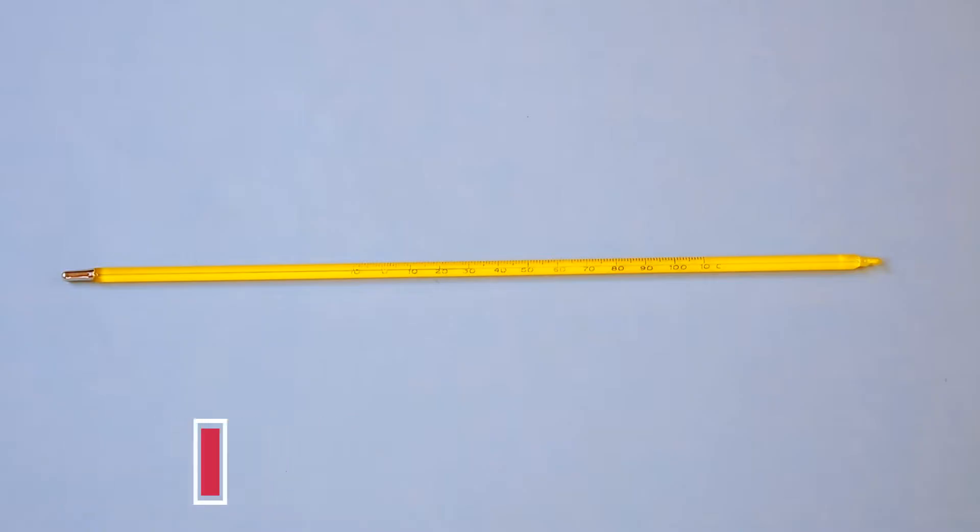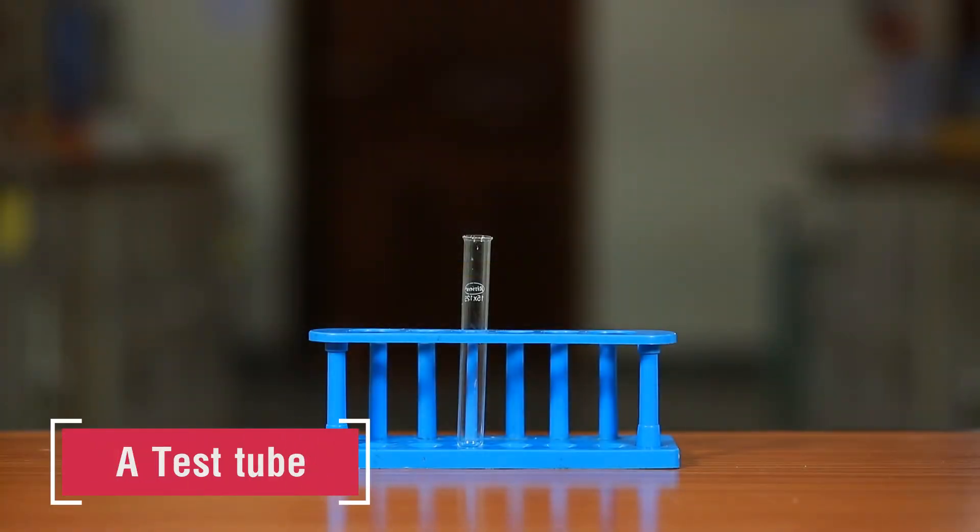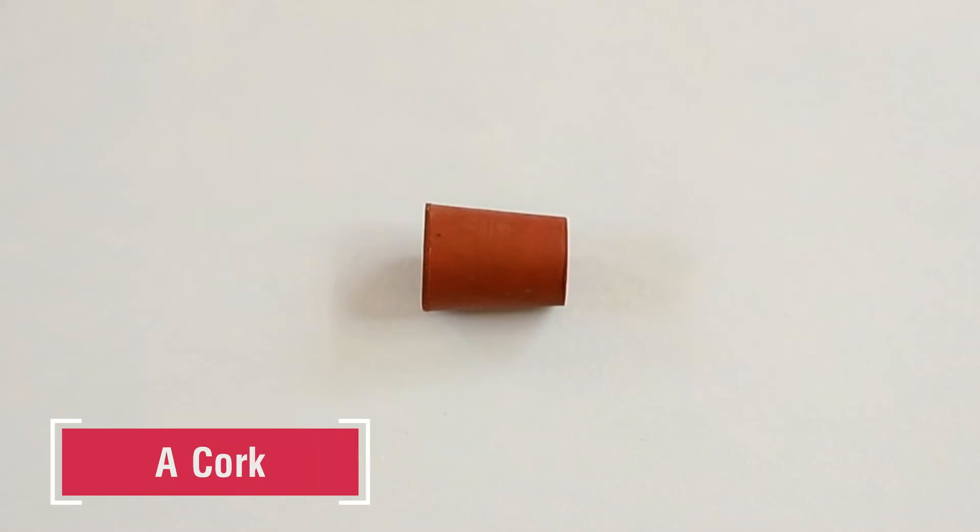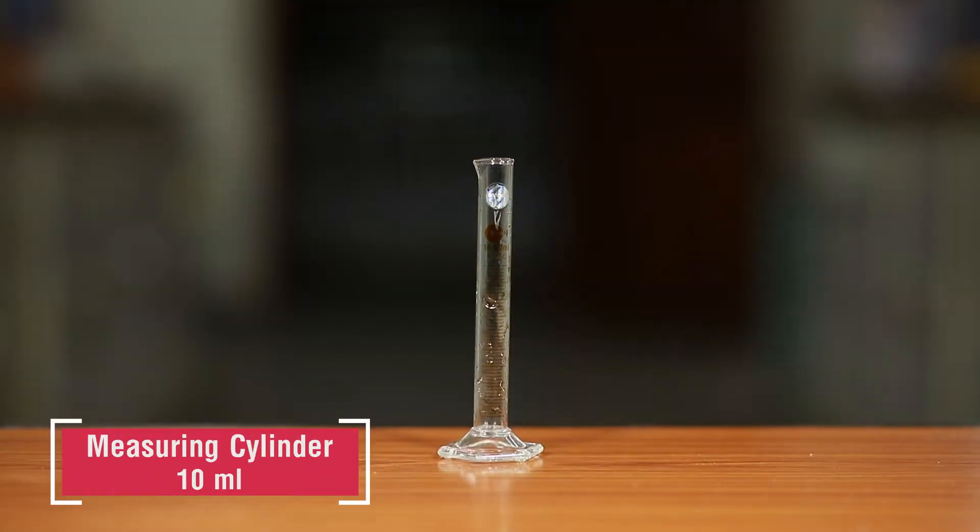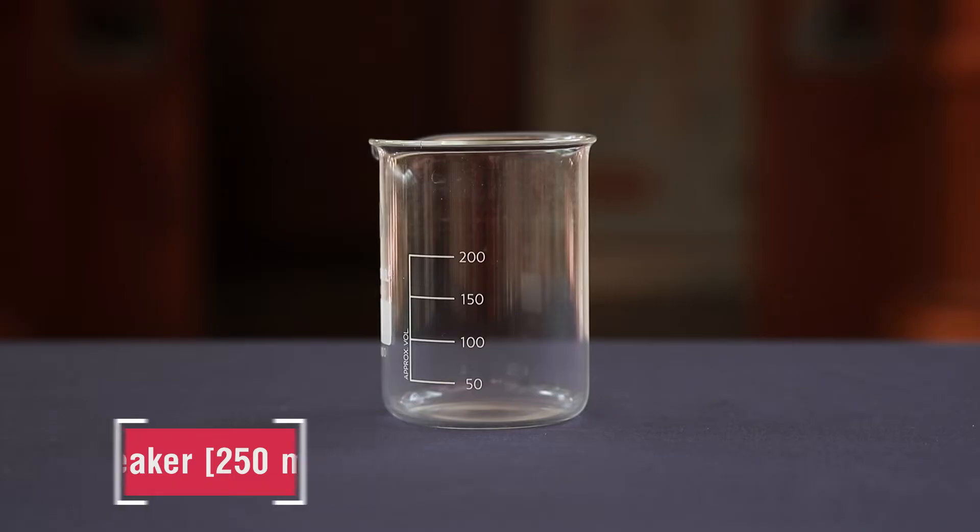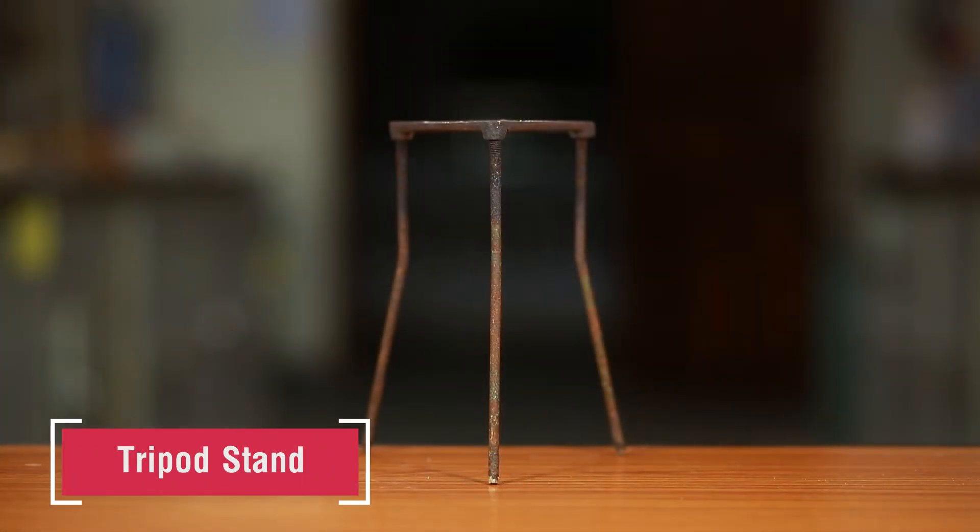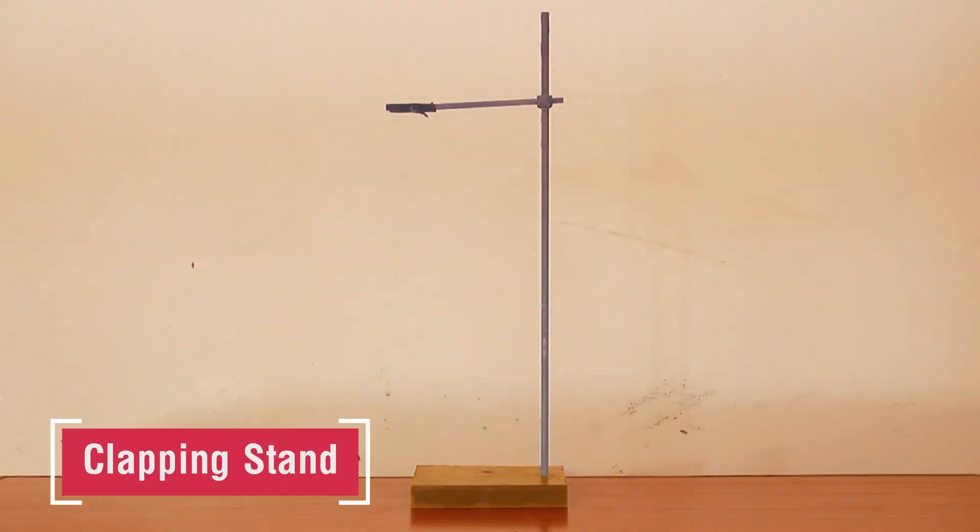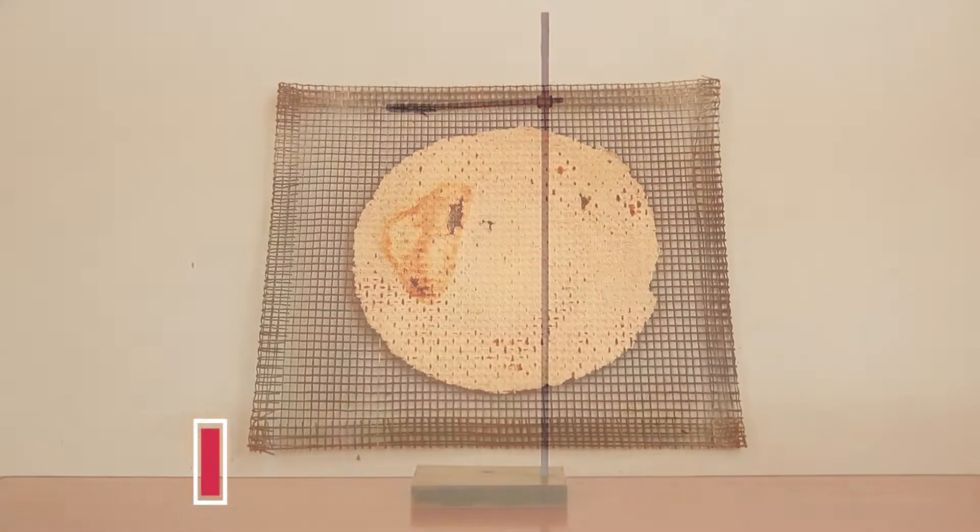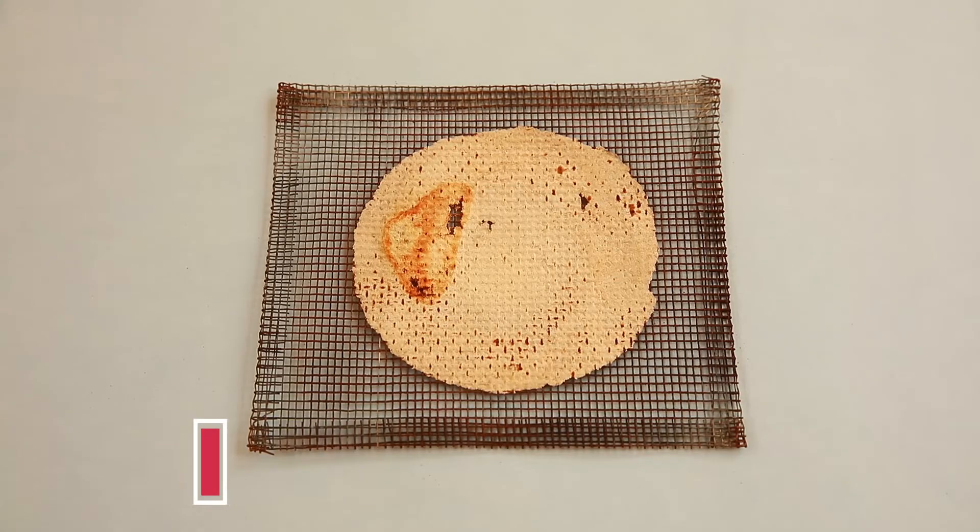Additional equipment: test tube, cork, 10 ml measuring cylinder, 250 ml beaker, burner, tripod stand, clamping stand, wire gauze, and dropper.